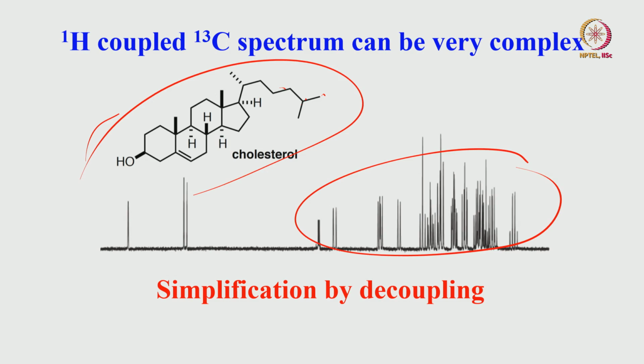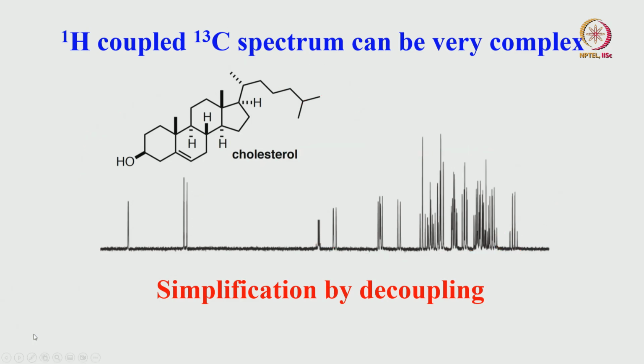That is the spectrum we got, so complex with all the proton couplings, you see. You can easily identify the patterns here. For example, here is a quartet. For example, this is a doublet like this. How do you simplify this analysis? There are so many multiplicities present here, they are overlapped. How do you identify triplet, quartet, etc. multiplicity?